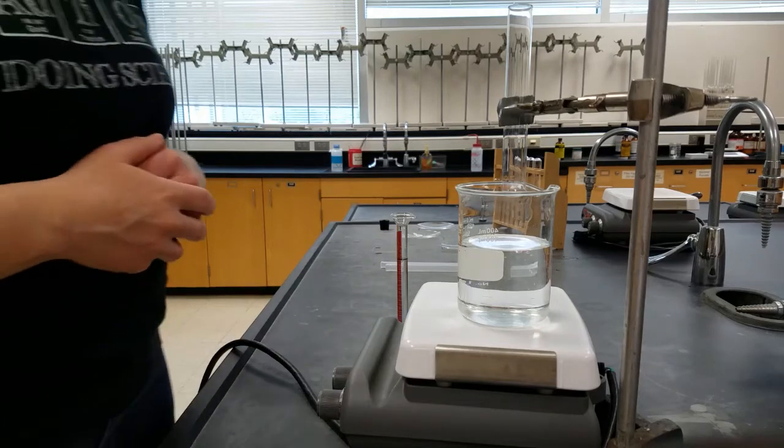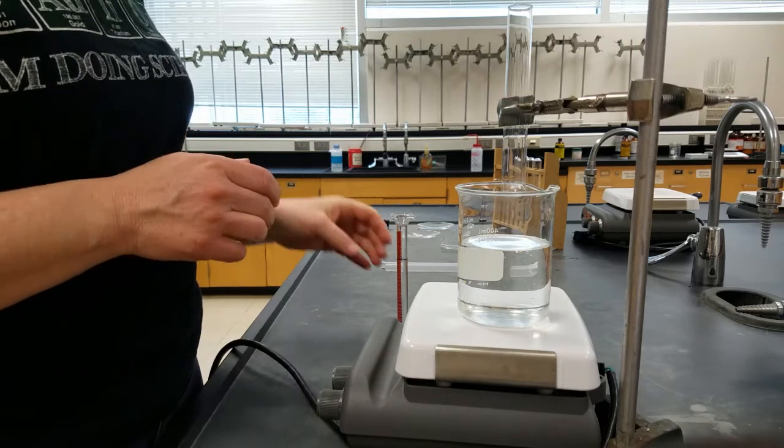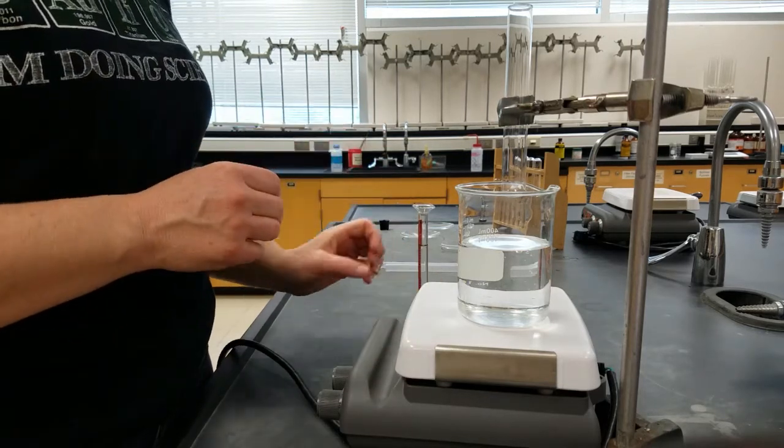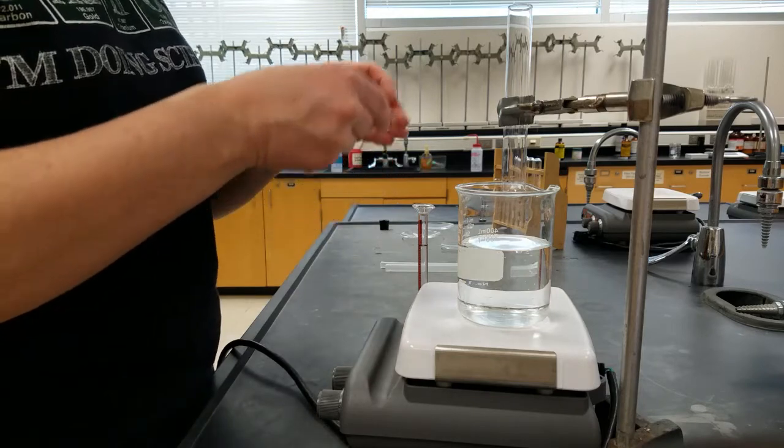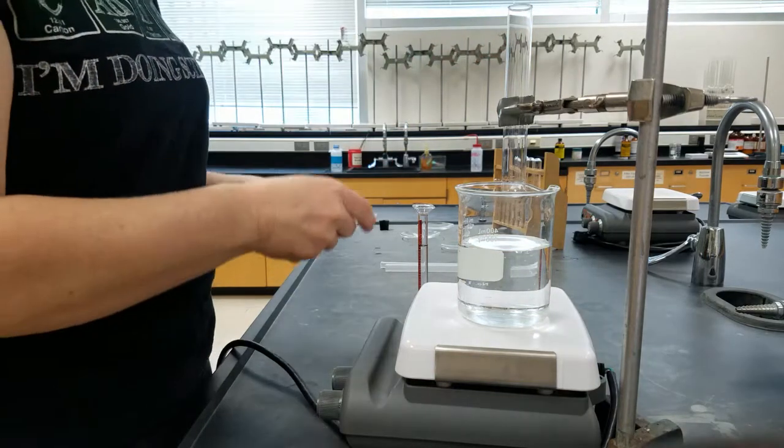Another physical property that we're going to use for the unknown liquid along with our density is boiling point. And so we're going to assemble our apparatus. We want to put a couple of boiling chips into a clean dry test tube.